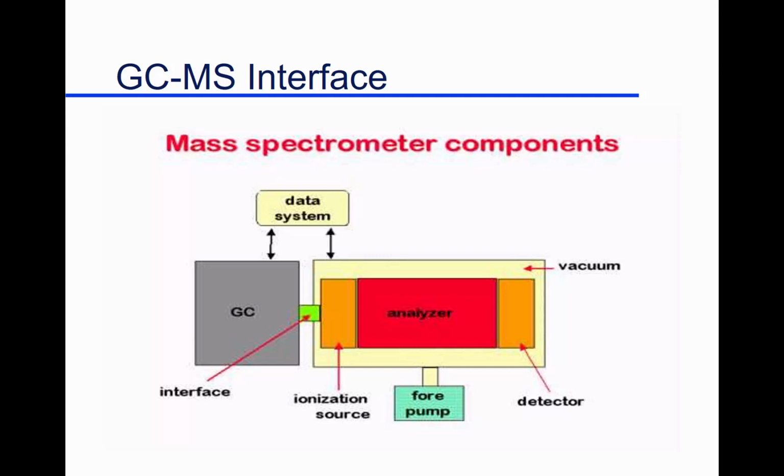If we go back in history a while, gas chromatography used to use fairly large columns, a 1/4 inch in diameter. Of course, today's gas chromatography uses 0.2 millimeter columns. So today we have tiny columns, which means we have small gas flows. We used to have very complicated systems of getting so much gas out of there to get it into the mass spectrometer.